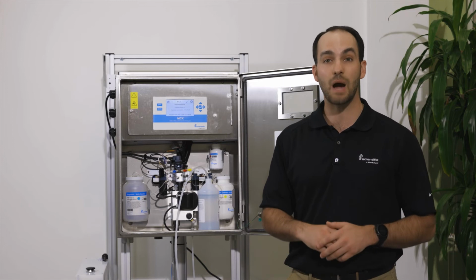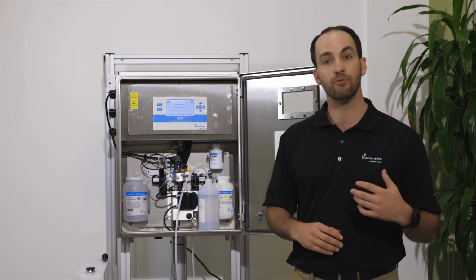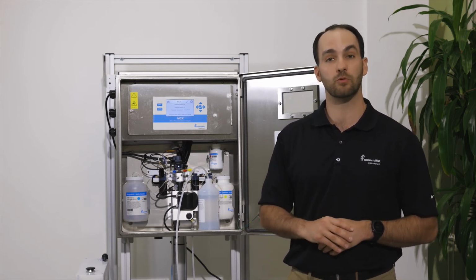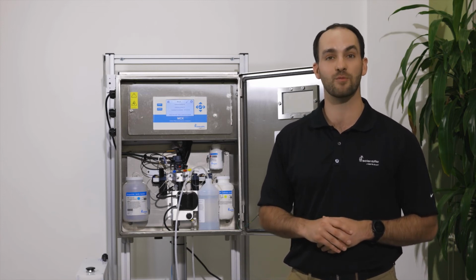If your value is not within that range, but very close to it, you can press exit and try recalibrating. Do another wash and then calibrate your 2 ppm standard. If your number is way off and you think there's something wrong with the analyzer, you can contact HF Scientific's technical support line for more help.